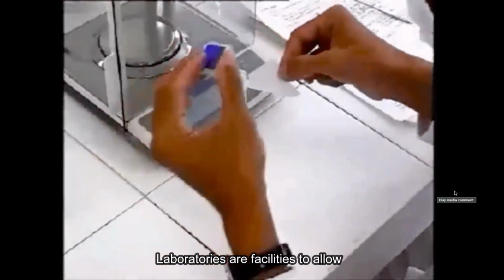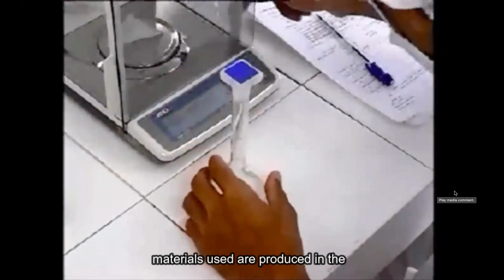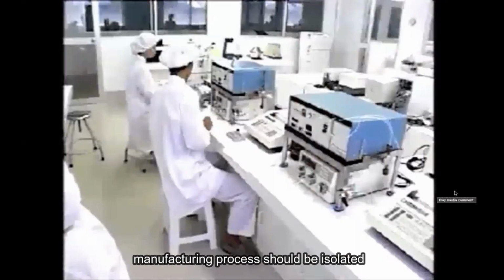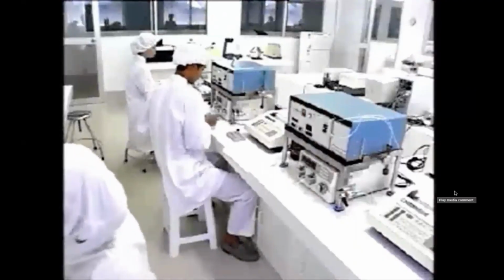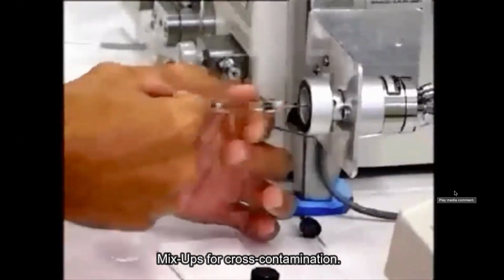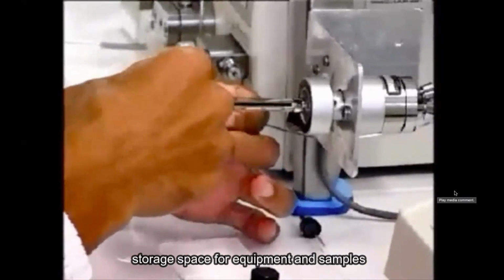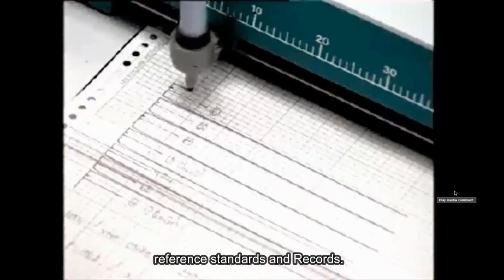Laboratories or facilities to allow testing of the quality of the various materials used or produced in the manufacturing process should be isolated from the production areas. They should have sufficient space to avoid mix-ups or cross-contamination. There should be adequate and suitable storage space for equipment and samples, reference standards, and records.